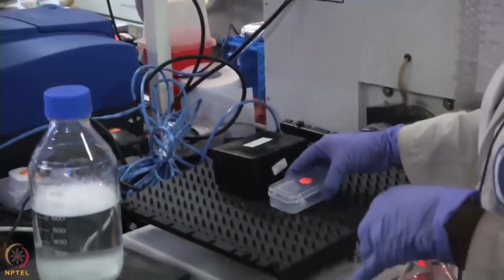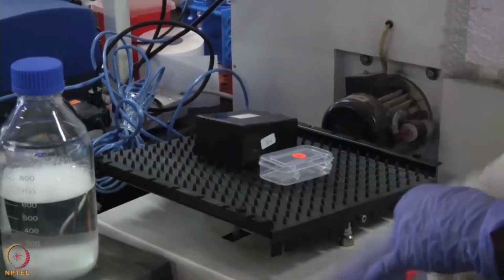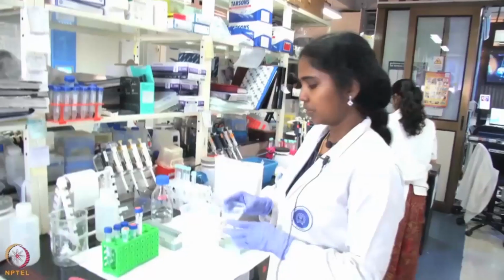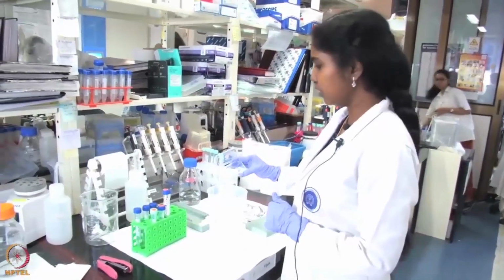Then you keep it on the rocker. This step has to be repeated 4 times for 5 minutes each. After the last wash, you have to discard the washing solution completely.